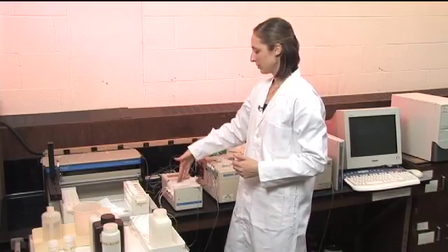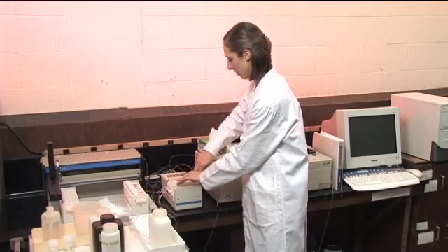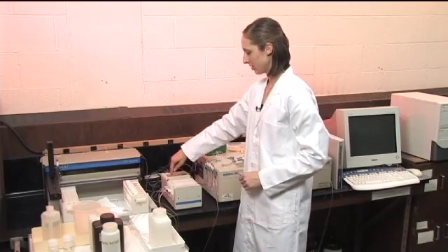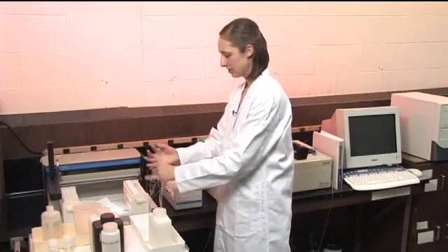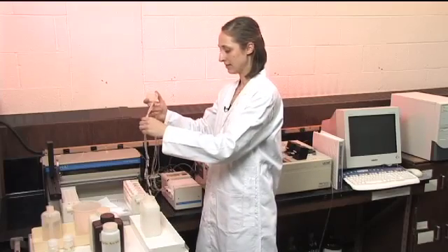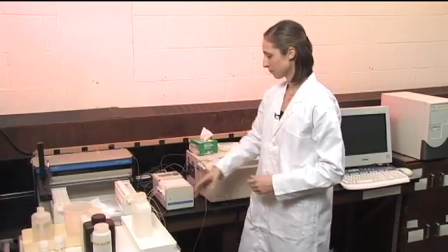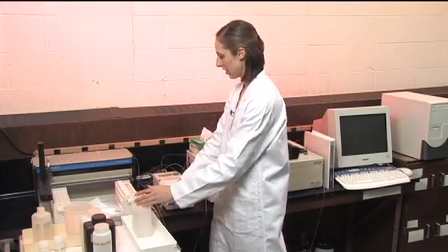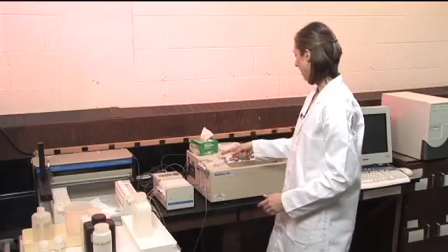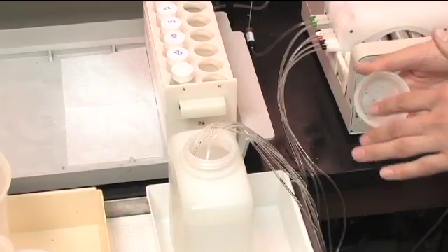So now that all the reagents, samples, and standards are ready, we want to hook up the flow and get the instrument going. We put all the tubes that go to the reagents hooked up to the pump, snap them into place, and then turn on the peristaltic pump. Just to make sure that everything is hooked up and flowing smoothly, we'll first put all the tubes into deionized water — not distilled — because we don't want to introduce any phosphate from those sources.